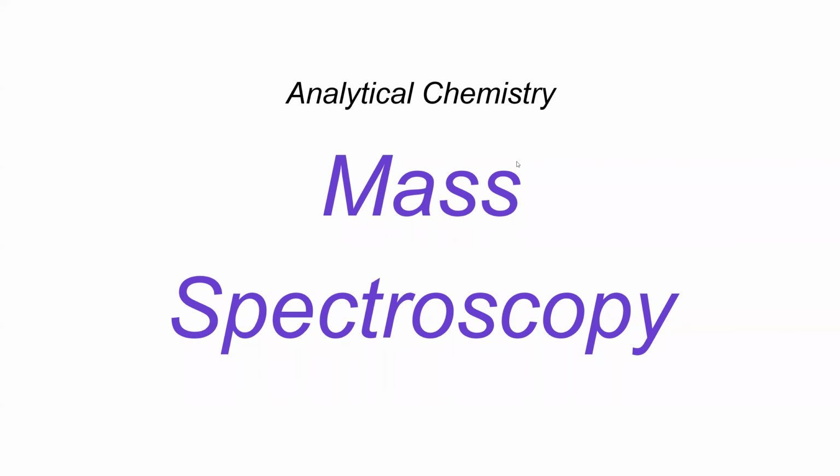Hello and welcome to this lecture on analytical chemistry. Specifically, we'll be talking about mass spectroscopy. So we'll be taking a journey through multiple topics on mass spectroscopy, from its background, from its theory. We'll be looking at some instrumental components. We'll be looking at how we can analyze some chromatograms, and we'll be having a look at how we can use mass spectroscopy in analytical chemistry.